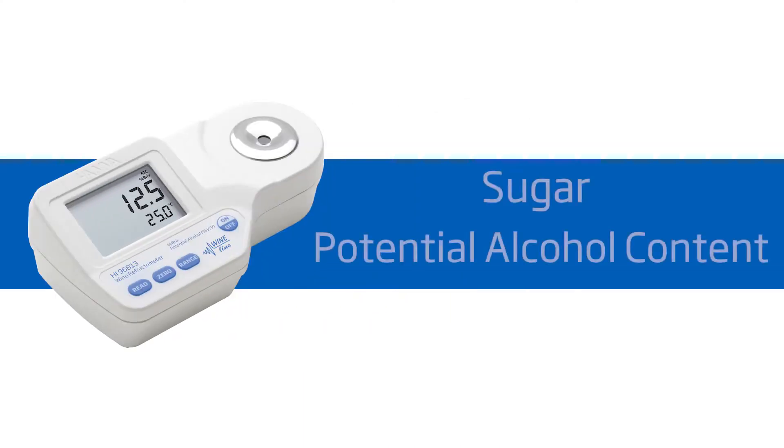Welcome to the Hanna Lab! My name is Doug and today we'll be featuring the Hanna HI96813 Refractometer for percent brix and potential alcohol in must and juice. This meter is ideal for winemakers measuring sugar and potential alcohol content. It offers high performance and eliminates uncertainty involved with mechanical refractometers, all at around $175.